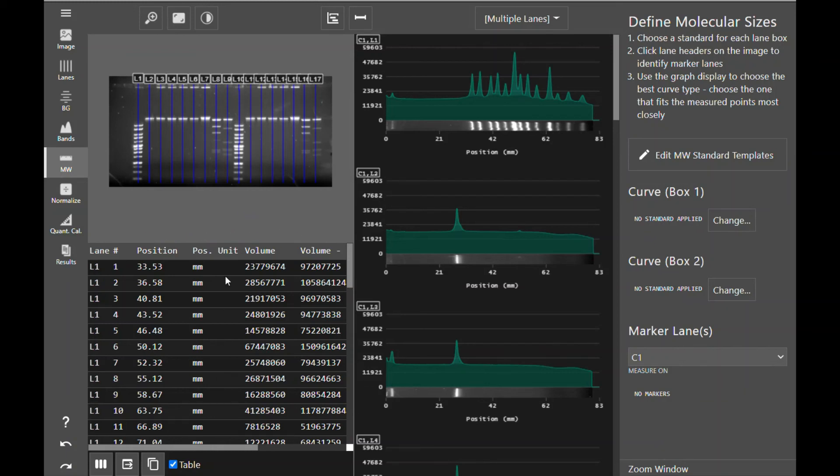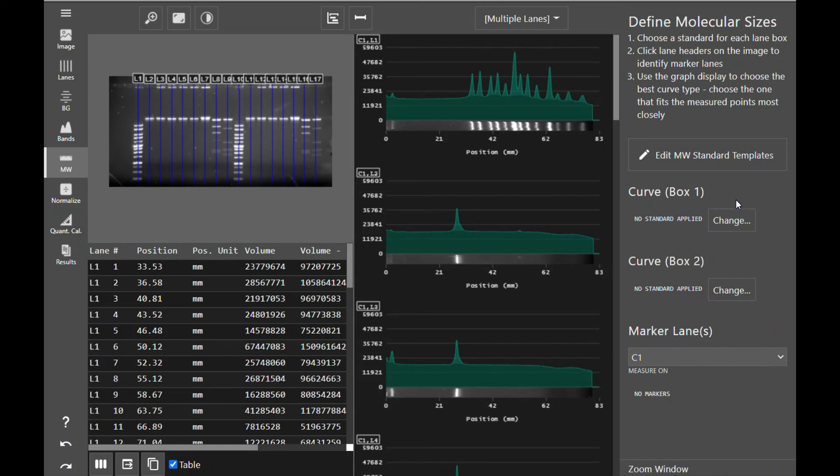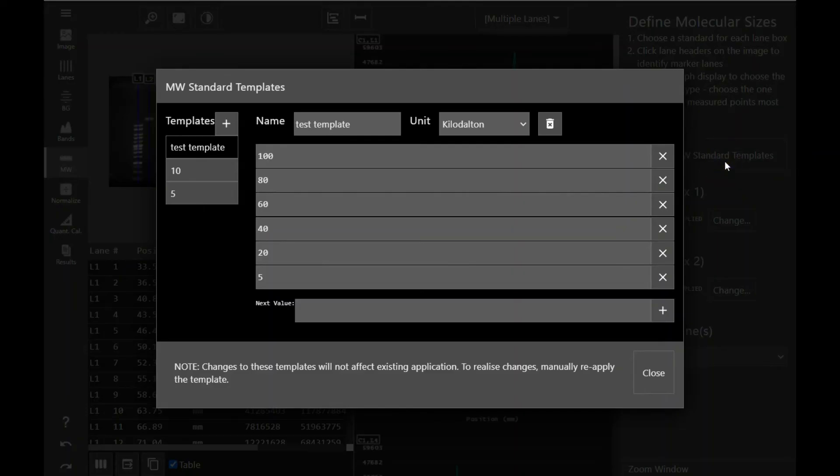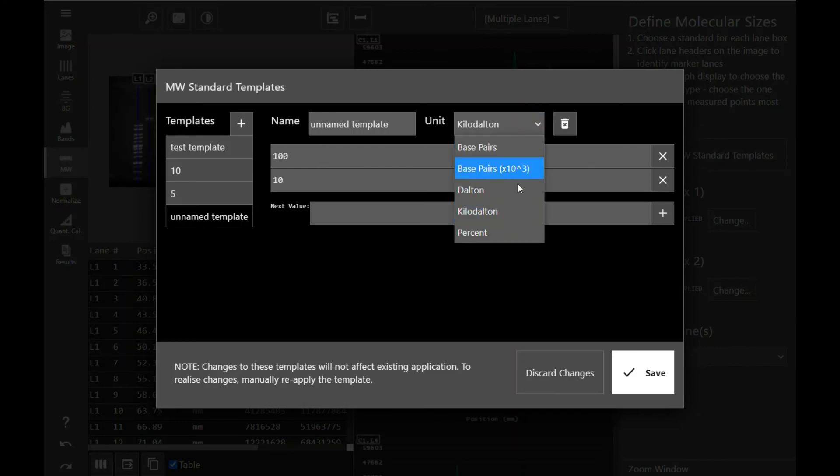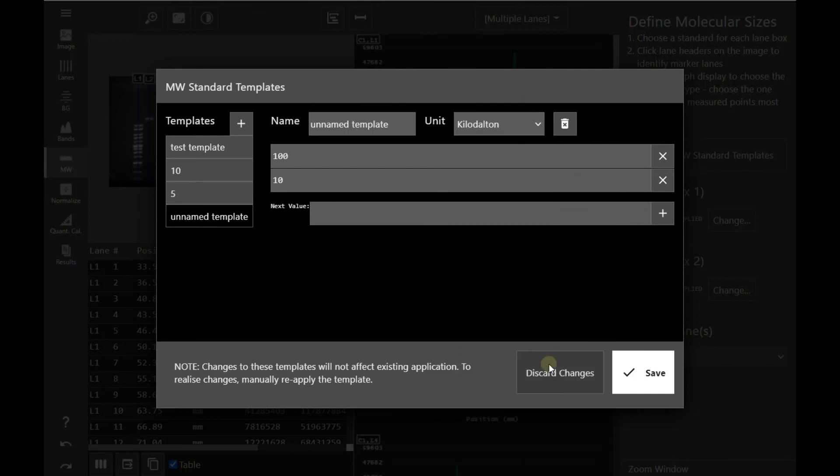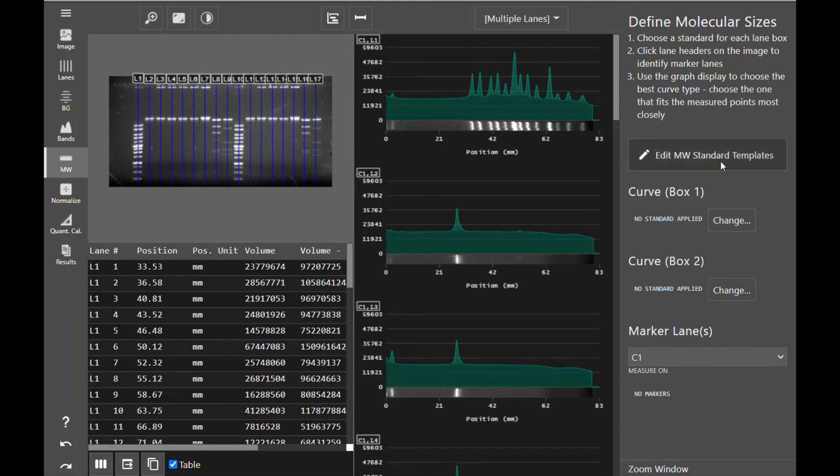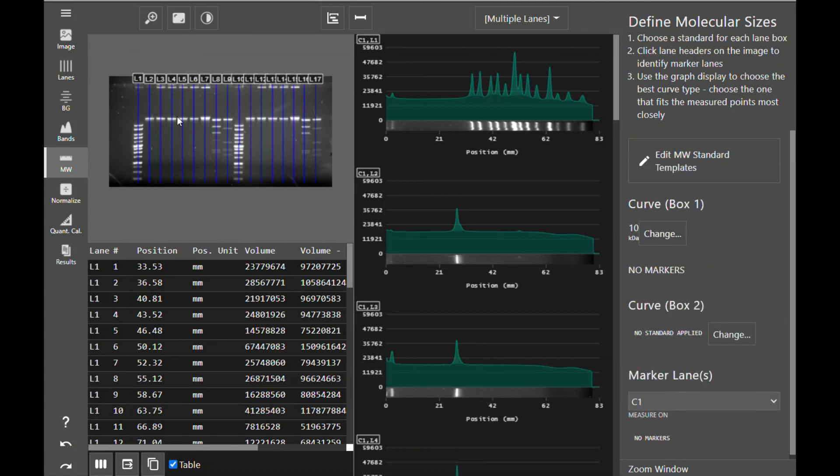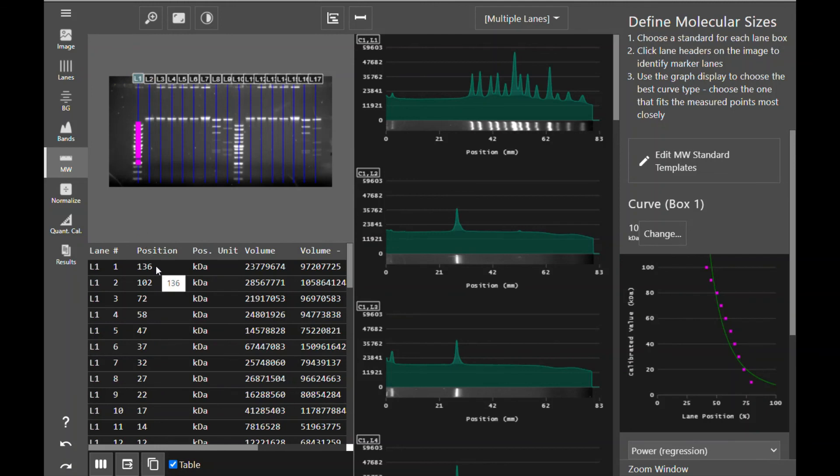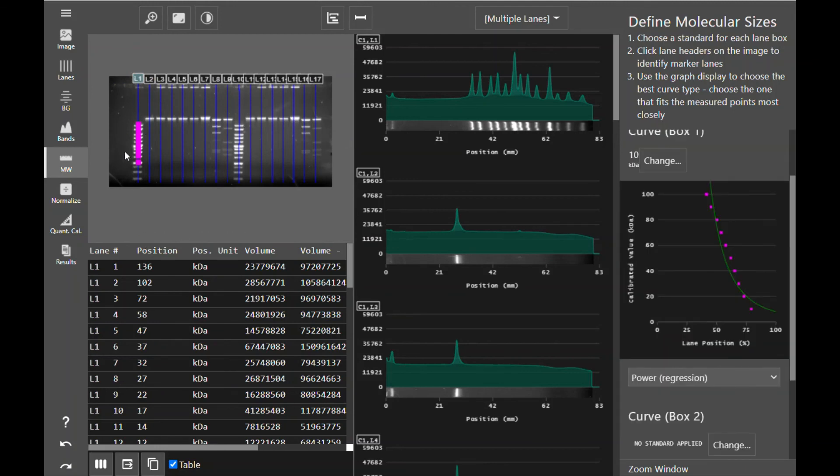In the band data table, you will see a position column along with a position unit. The default is currently at millimeters from the top of your gel. And once you apply a marker and create a standard curve for your image, that will change to the unit of your choosing. You can add your standard curves by clicking the edit molecular weight standard templates. You can add new templates by clicking the plus sign and adding in any values present in your marker. You can also choose the unit and give your template a name. Once you have your most used template stored in the software, click change to select the template you'd like to use. And then click on your marker lane to apply the template. Once your template is applied to the specific lane you've chosen, a graph will appear.